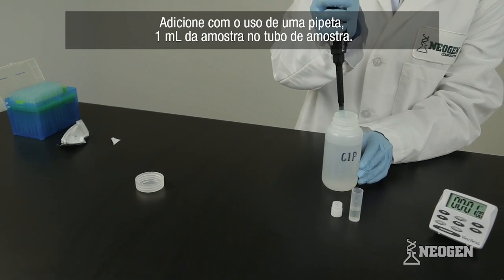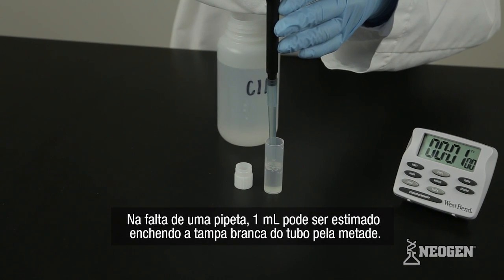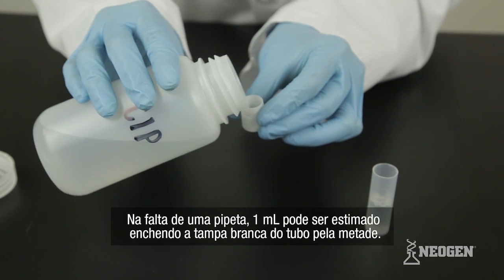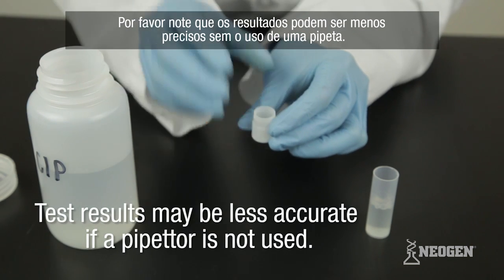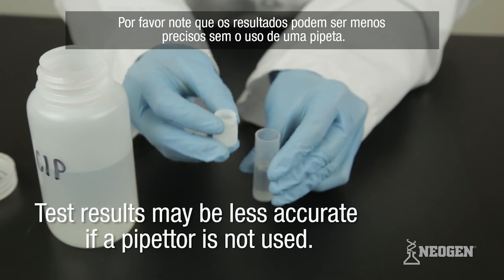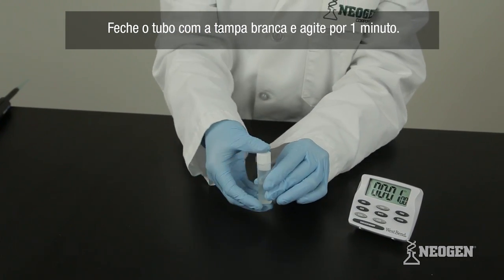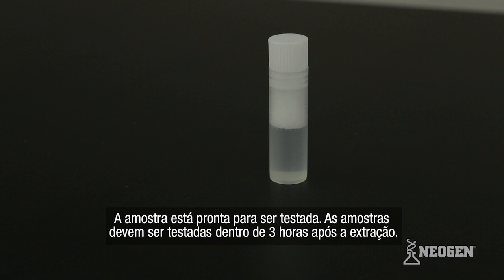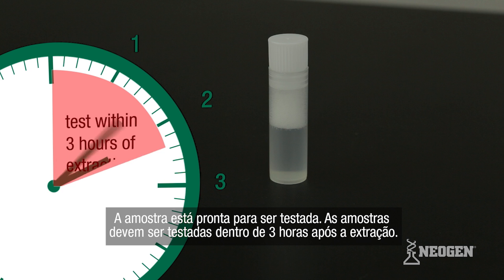Pipette one milliliter of sample into the sample tube. If you don't have a pipetter, you can estimate one milliliter by filling a white sample tube cap up halfway and adding it to the sample tube. Please note that test results may be less accurate if a pipetter is not used. Secure the white cap and shake for one minute. The sample is now ready for testing. Sample should be tested within three hours of extraction.